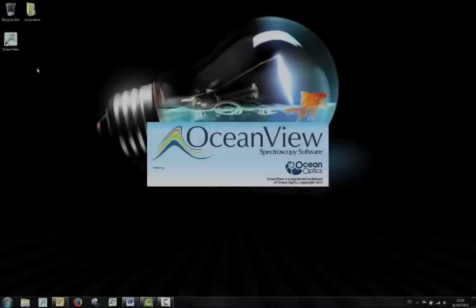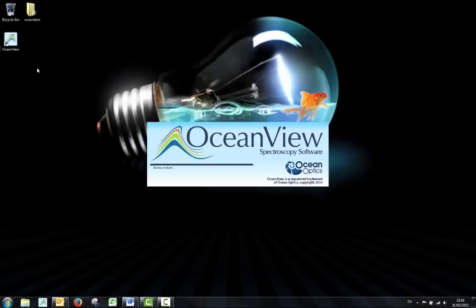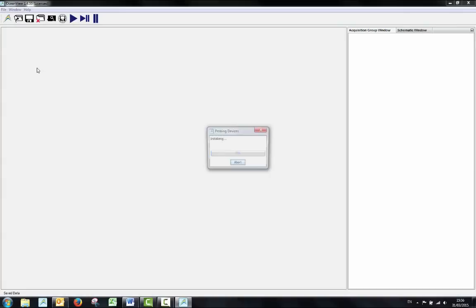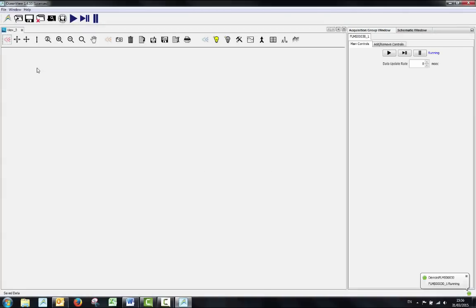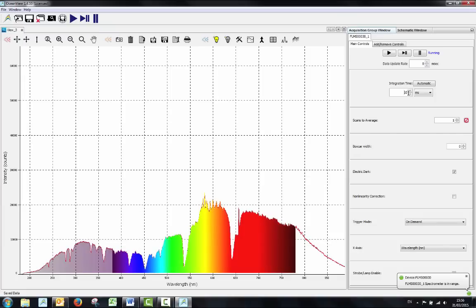Now you have set up your experiment, open up the OceanView software. You will be greeted with the raw spectrum of light being received by your spectrometer.